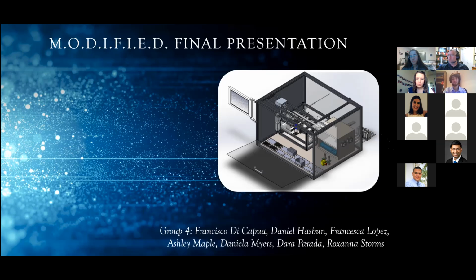Does it ride on a linear rail, or how do you constrain the motion on it? There's a track that is attached to the carriage of the liquid handling and the claw, so it'll slide along inside the grooves of the 80/20. Okay, so like the tracks in DML? No, we found some off of the 80/20 website that was compatible with 80/20.